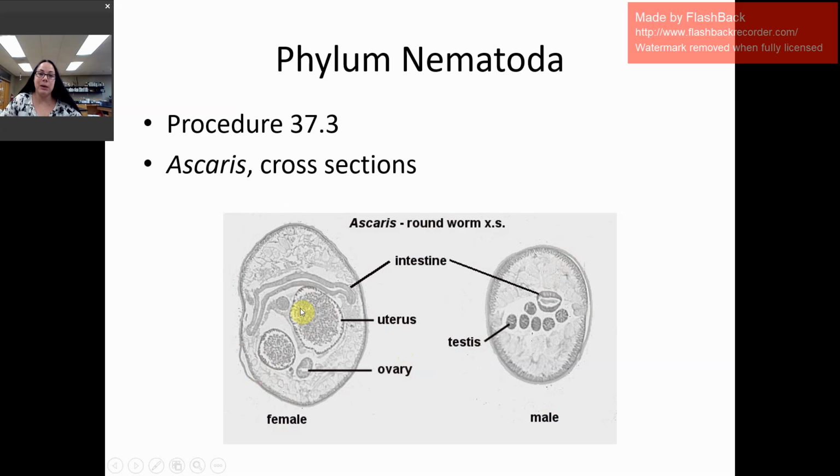It's because the female reproductive organs are larger than in the male, and so you can see here the uterus that contains plenty of eggs. That gray shadow, those little dots here, those are eggs. Same over here. So those are two sections of the uterus of the female. The little one here is the ovary. This is most likely ovary as well.